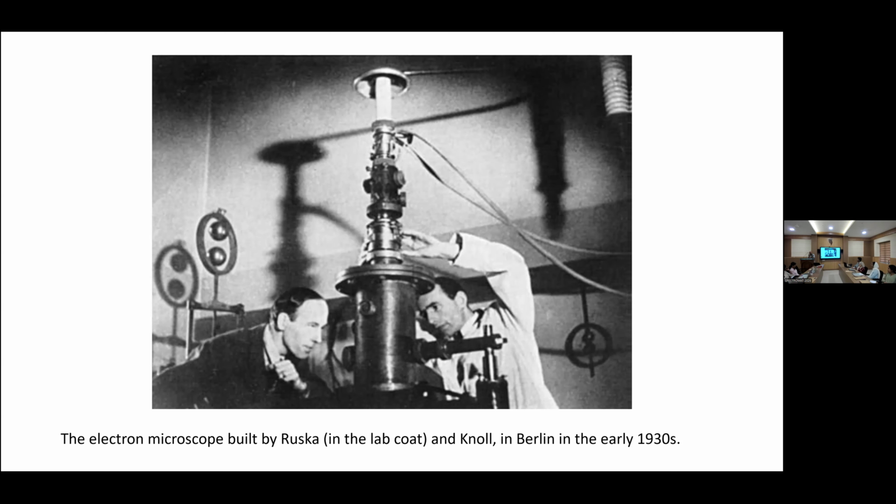Then in an electron microscope, we are using an electromagnetic lens. So what is an electromagnetic lens? This is just a coil. I will discuss this on the instrumentation side. It's just a coil like our fan or any windings. If we induce some current, then a magnetic field will be there. That magnetic field we use for bending the electron beam.